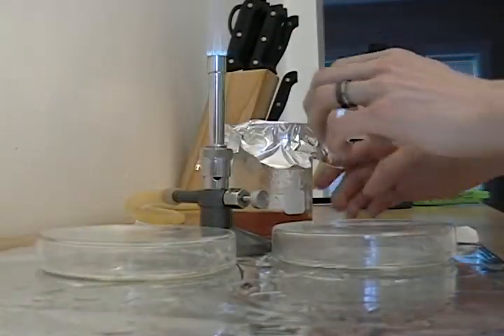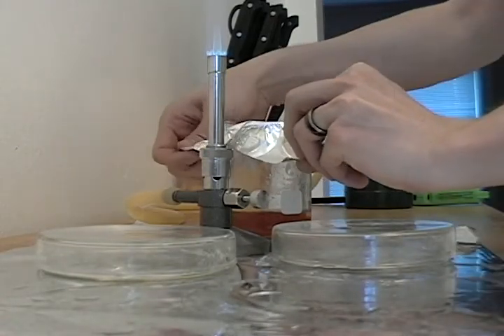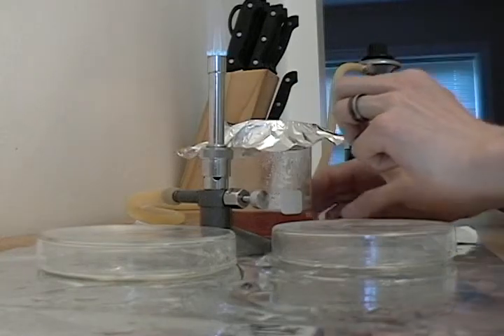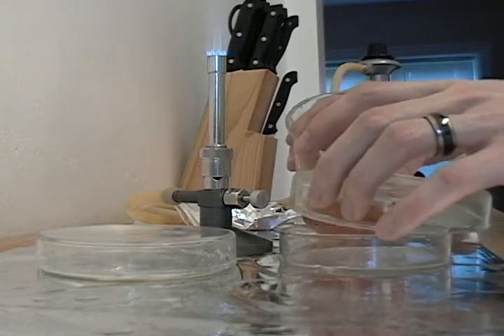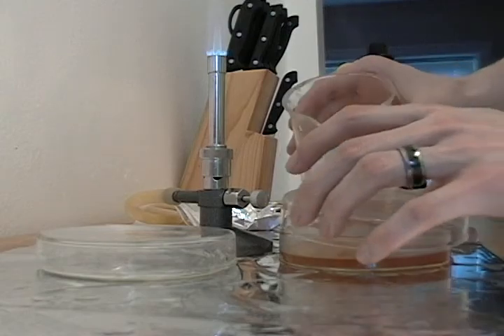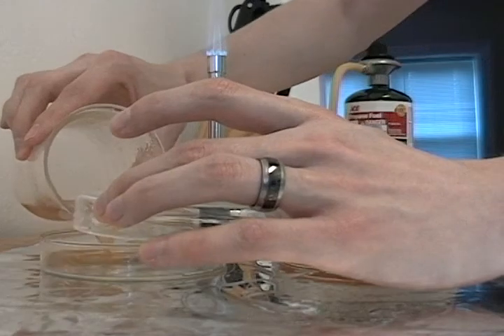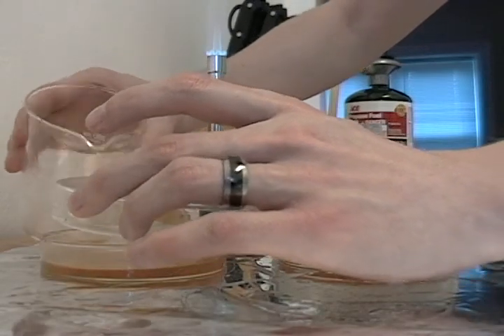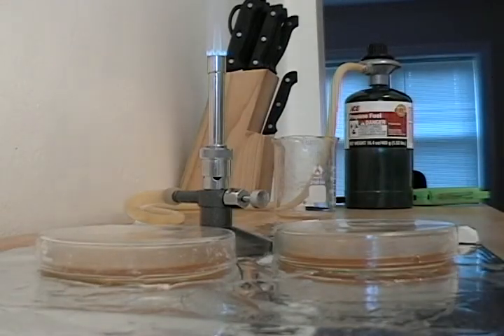Now we're ready for the pouring of the plates. Carefully undo the aluminum foil on the wort. Quickly open the lid, pour, close. Same for the other — quickly open the lid, pour, close. Now we just have to wait a couple of hours for it to solidify and we'll come back when that process is complete.